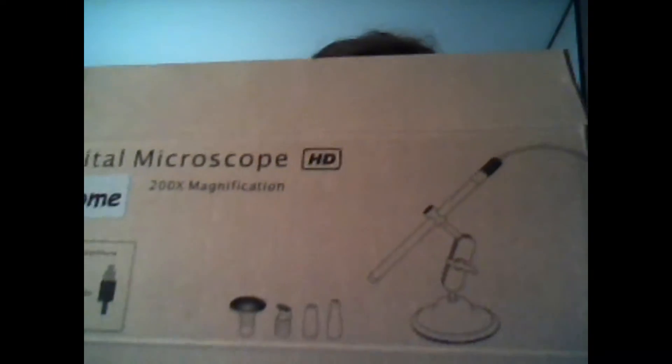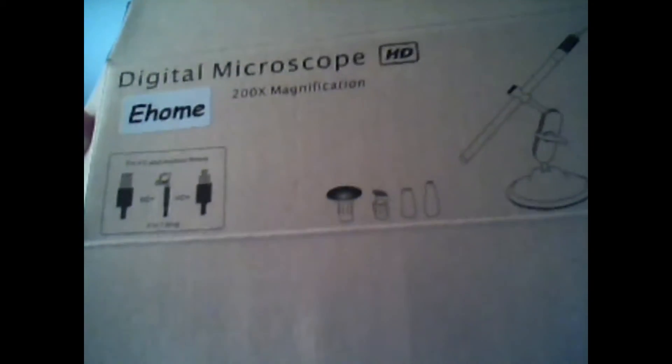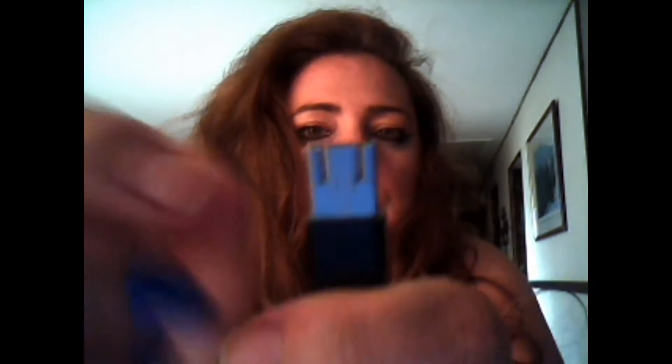This is the digital microscope, up to 200 times magnification. It comes with some attachments and also a USB that can be used with your computer or your Android phone. The USB connector flips — it's like a little hinge, kind of magic.